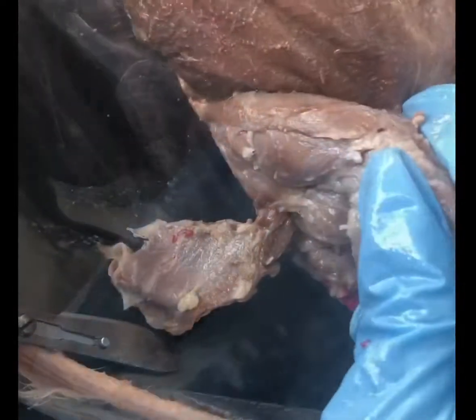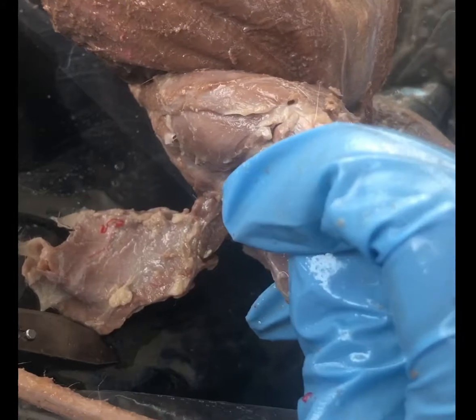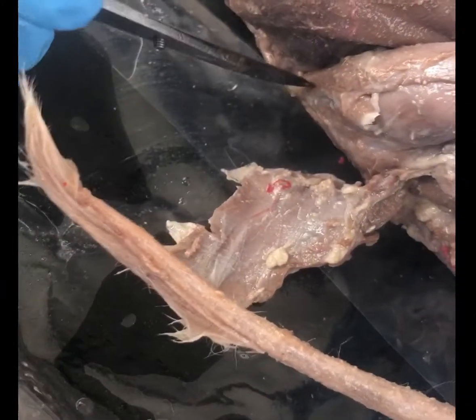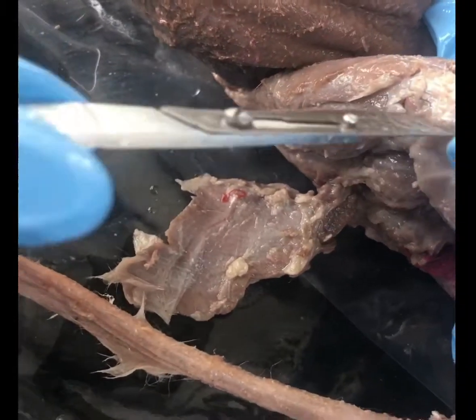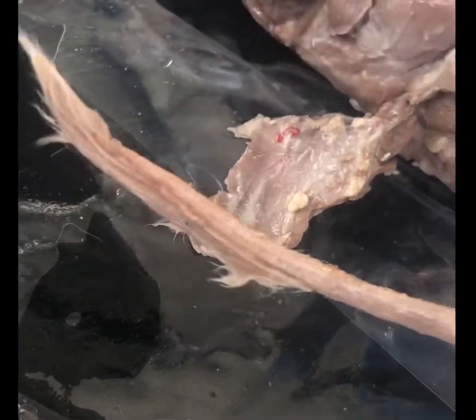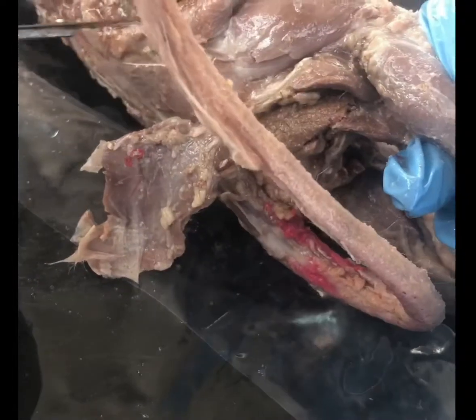And then the semitendinosus extends the thigh and flexes the leg, and it's like the muscle that goes from the gluteus maximus to the patella on the side. So it'd be this muscle. No. It'd be this muscle right here.